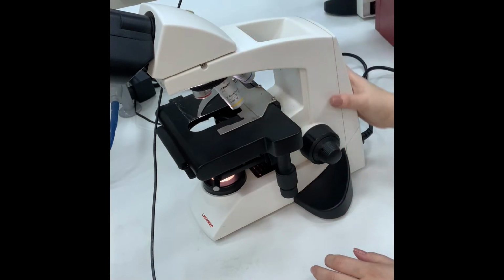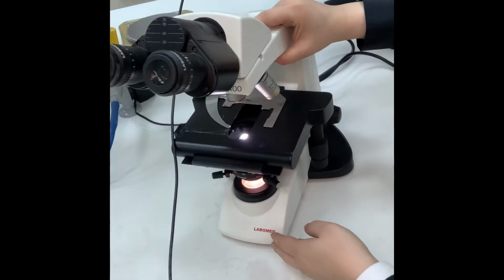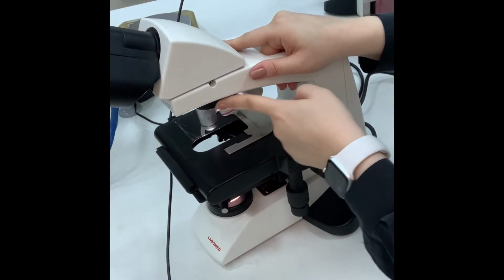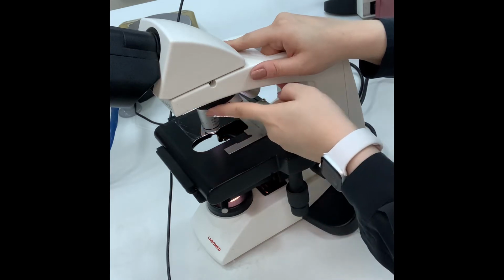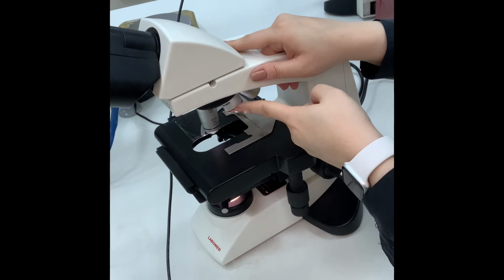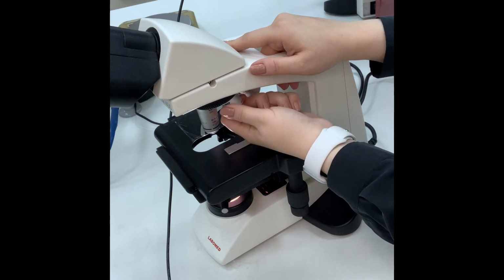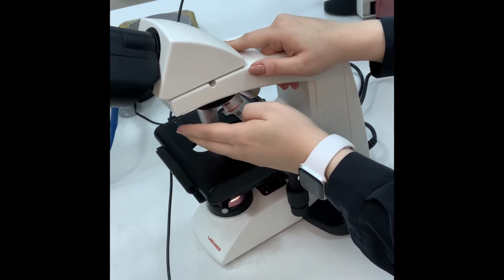This is the arm of the microscope that carries the stage. And over here I have the black round, you cannot see it. This is the revolving nose piece. It carries the objectives, and from the name it revolves in order to move from one zoom to another. These are the objective lenses, and the lenses are magnifying lenses attached to the revolving nose piece.